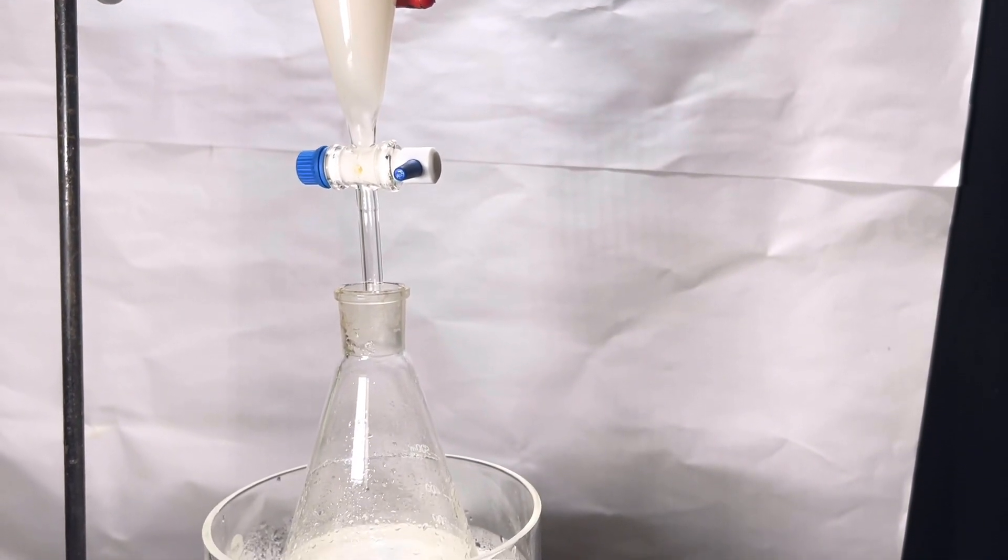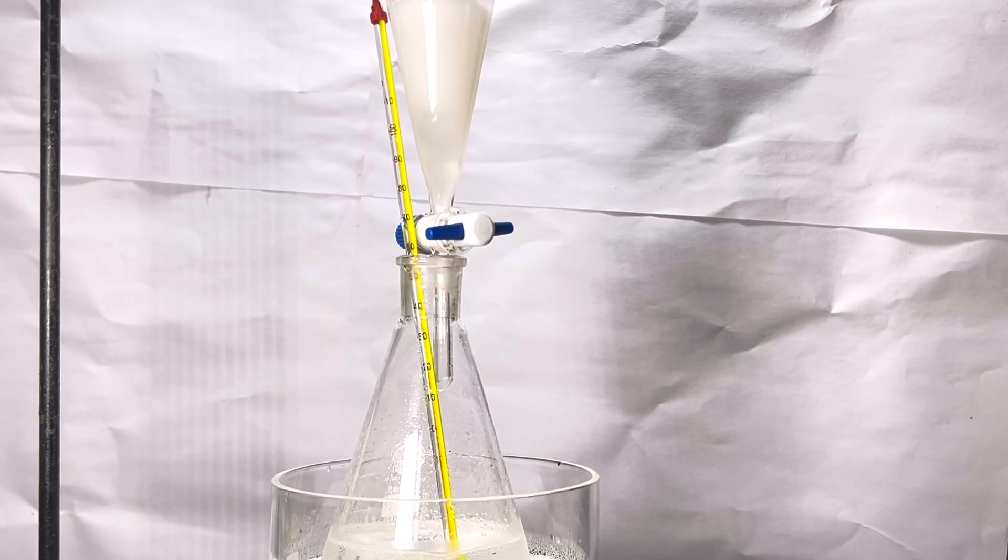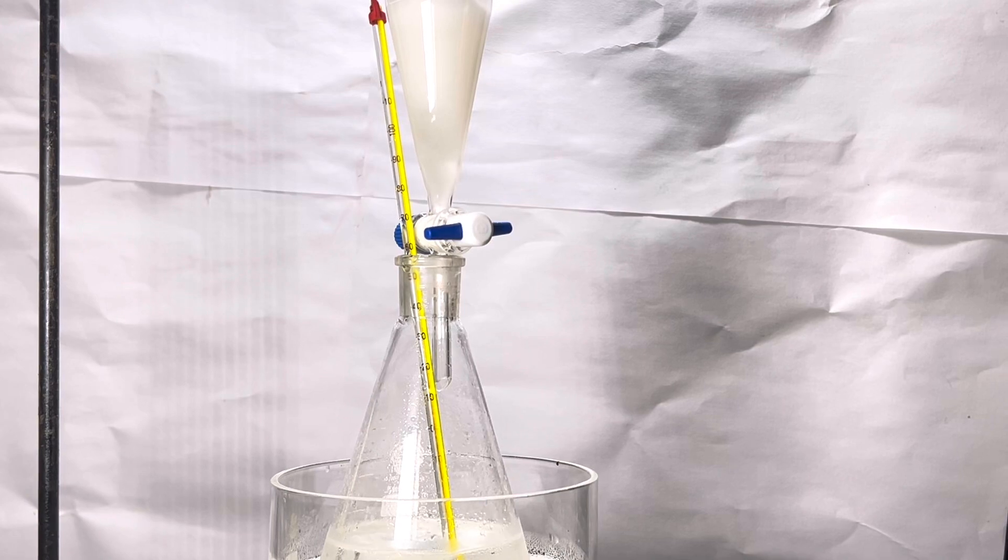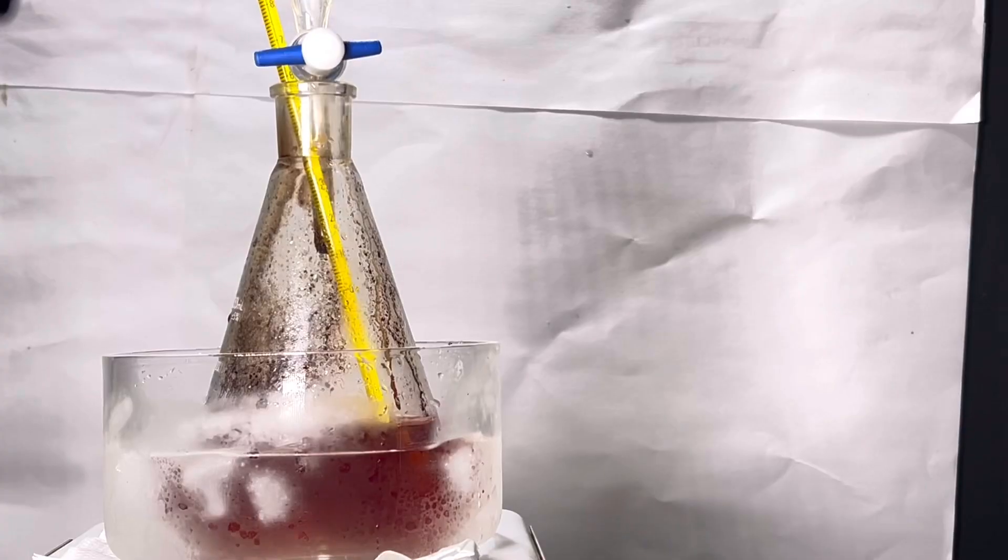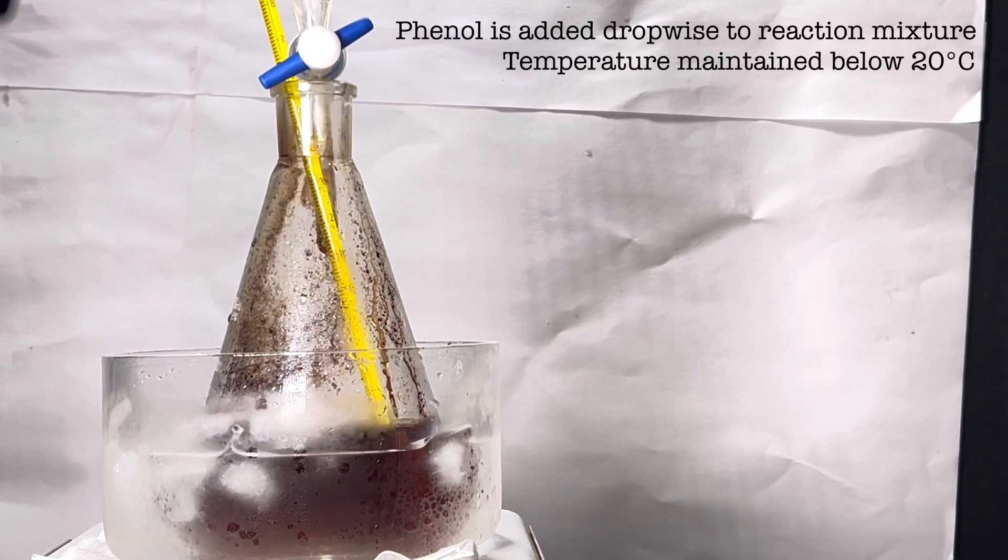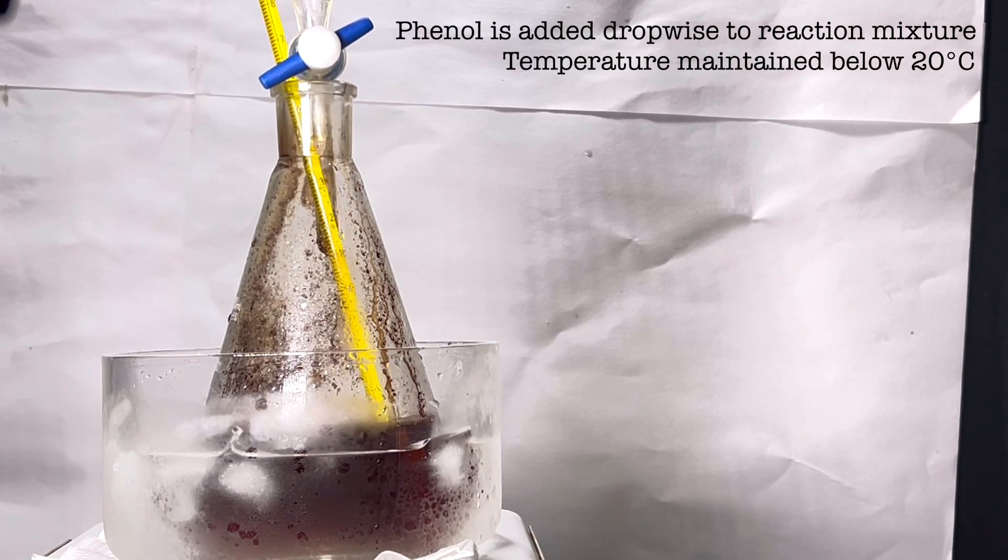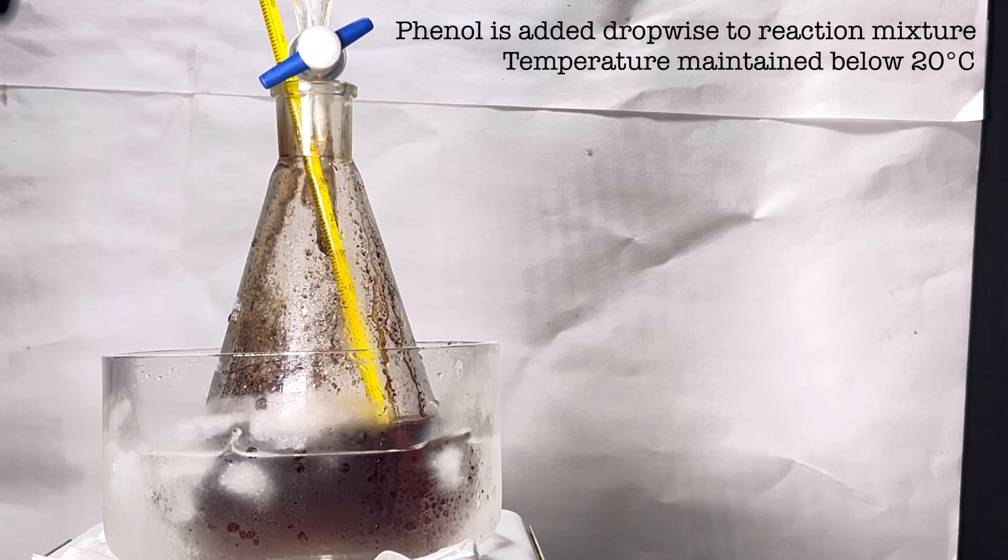The separatory funnel was placed on top of the acid mixture and the ice bath was kept during the whole time of addition of the phenol. A thermometer was also placed to monitor the temperature. Temperature should be kept below 20 degrees Celsius. Phenol is dripped slowly and you can see the color inside the flask is very dark red to almost black. The mixture was continuously stirred and the drip rate was adjusted from time to time.